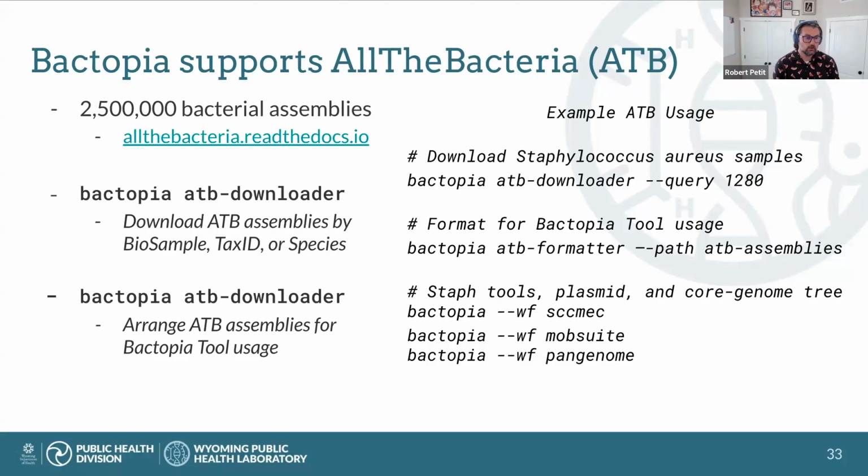So the All the Bacteria project uses biosample as their sample ID. And so if you have a list of publicly available samples that you want to include, you could. A good example is there's a paper and you wanted to include those samples, that sort of thing.